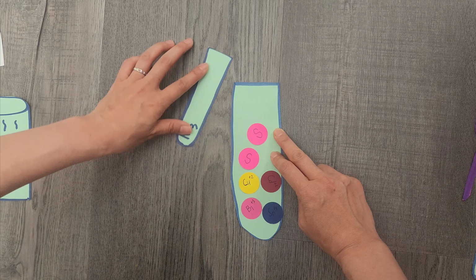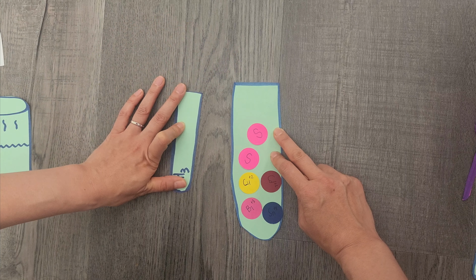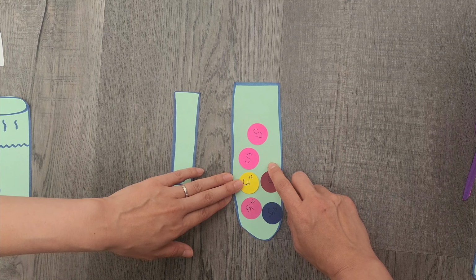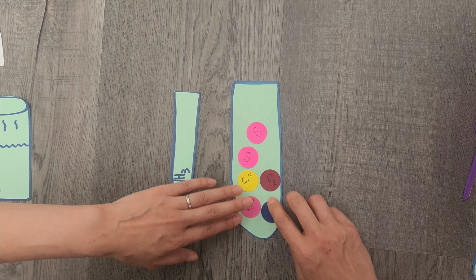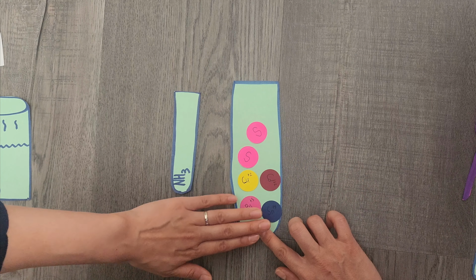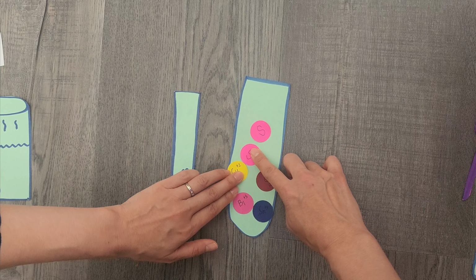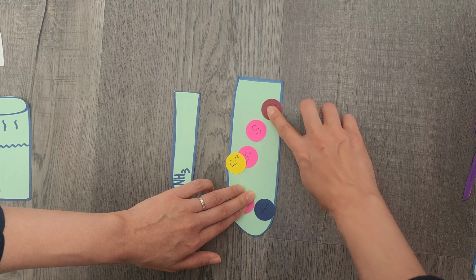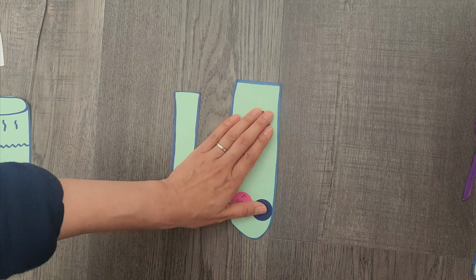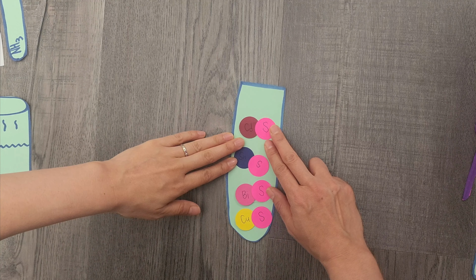You'll need this, and then you'll put like a drop. You just need a drop, and what's going to happen is you're going to be allowing these to precipitate out. All of these will start to form into this. So the copper and sulfur will combine, cadmium and sulfur will combine, and these will also combine with sulfur. So let me put that on there. So here are all the precipitates.